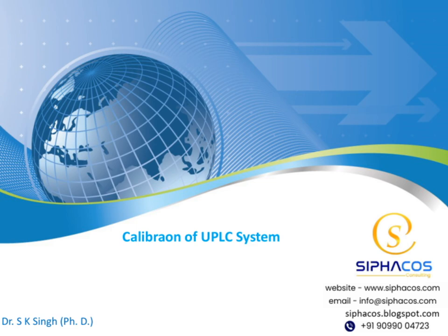My name is Dr. S.K. Singh, and I will be guiding you through our presentation on calibration of UPLC system. This is an important topic in ensuring accurate and reliable analytical results. Today, we'll cover the key steps involved in calibrating a UPLC system, the best practices, and some troubleshooting tips. So, let's get started and explore how proper calibration can enhance our analytical performance.